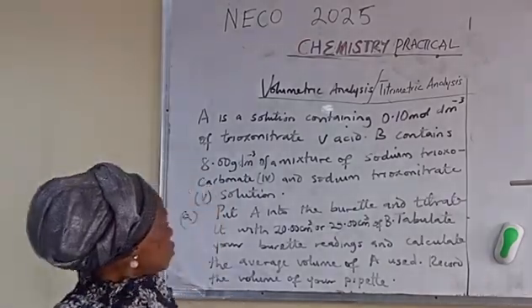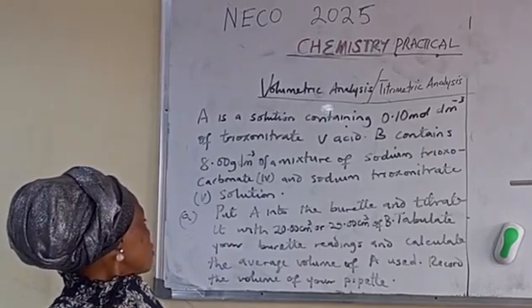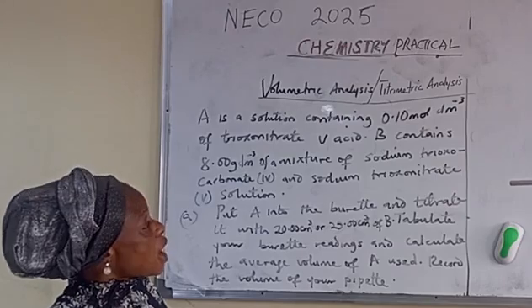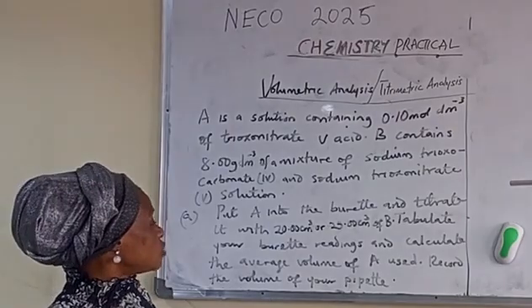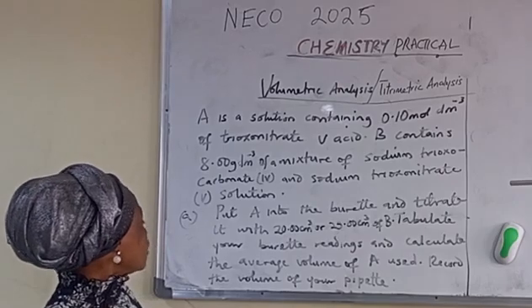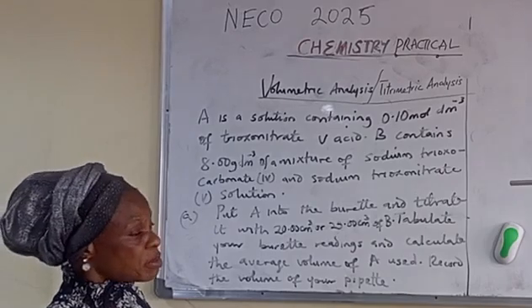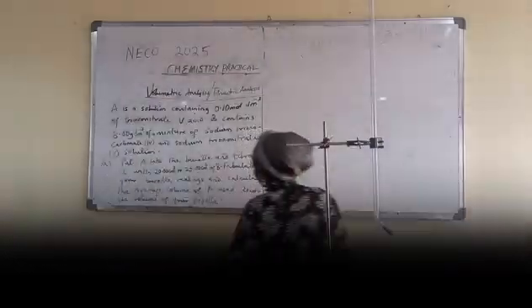In this, you have to learn how to tabulate properly because it will help you get more marks. And make sure your work is neat. Your table for your burette reading, make sure it is neat. If it is rough, you have started losing marks. So here we go. Look at how I want to tabulate my own.